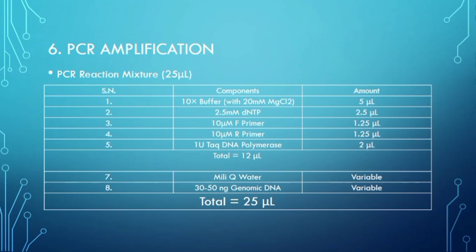These are plastid genes, and we know that fungi don't have plastids, so you are not going to find these genes in fungus. For animals, the gene cytochrome oxidase I is generally used for identifying animals.